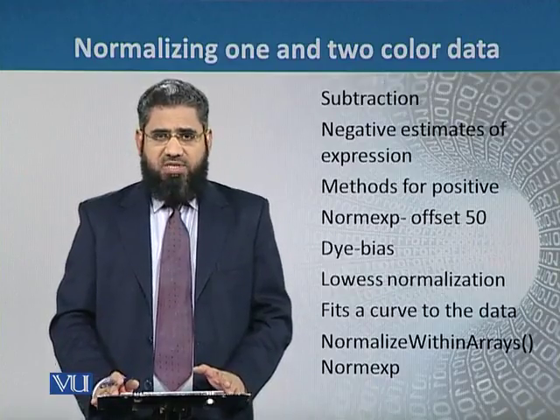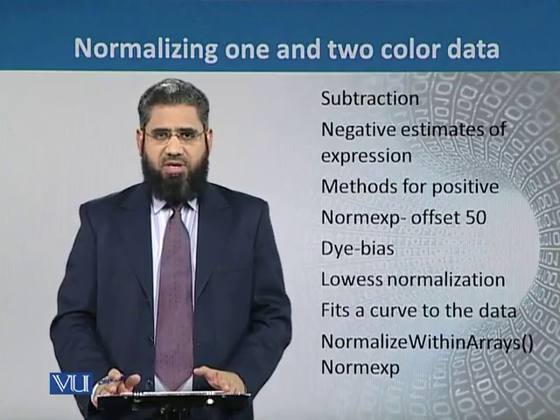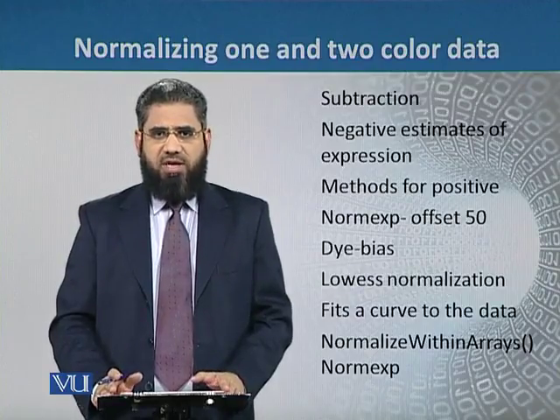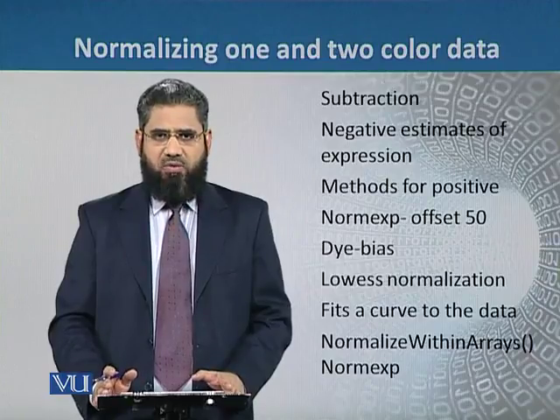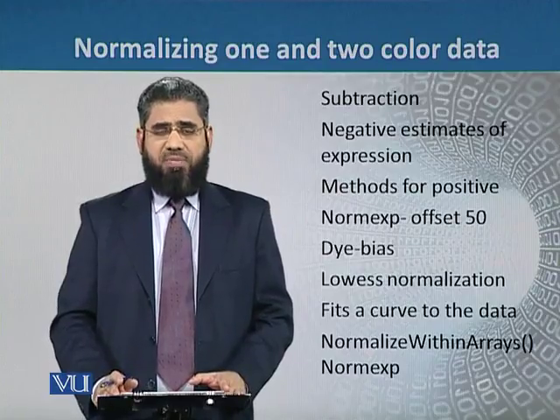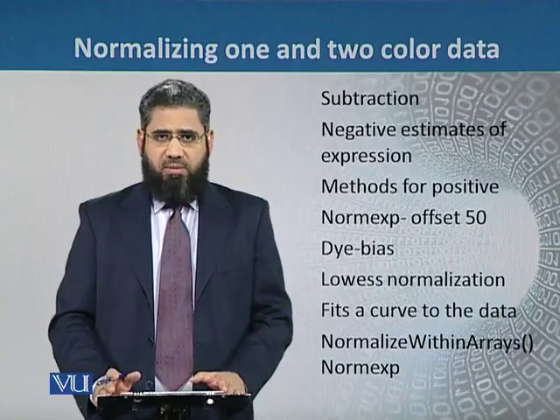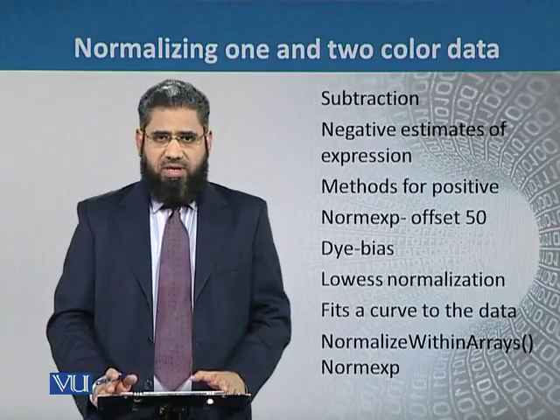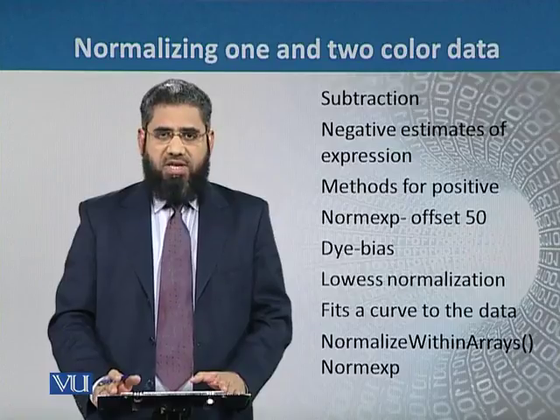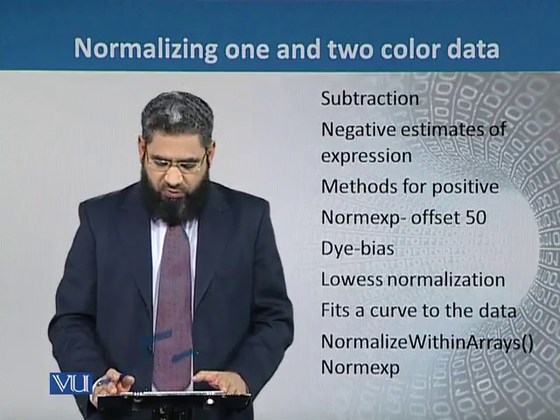The only drawback of this process is that when we subtract the background intensity, sometimes we get a negative value after subtracting from the spot intensities. To overcome this problem, there are many tools for the correction of background intensities, so that we always get a positive answer for all of the spots of the probes.